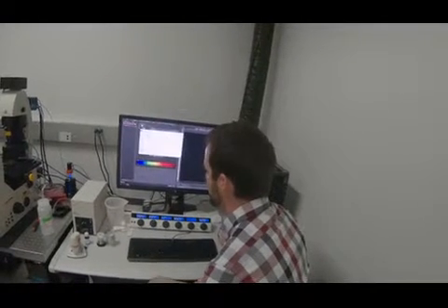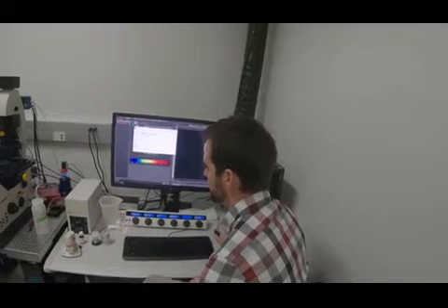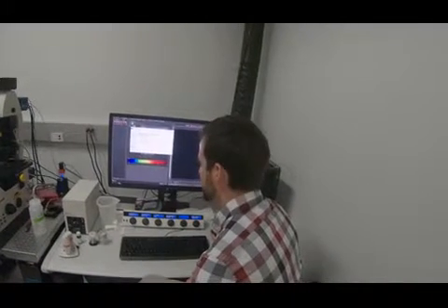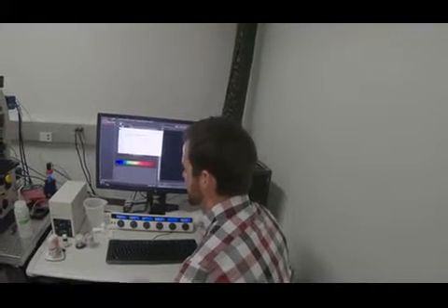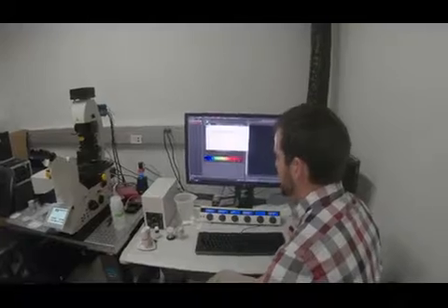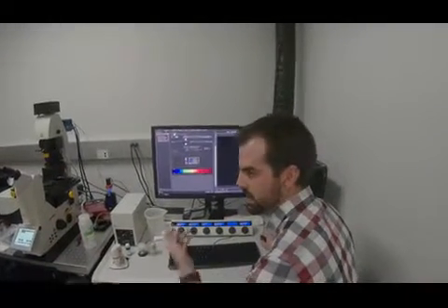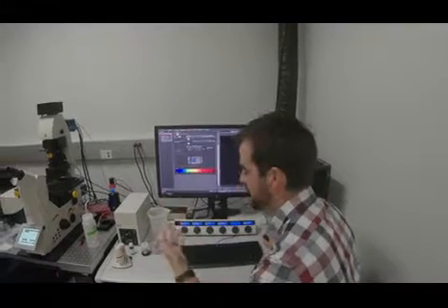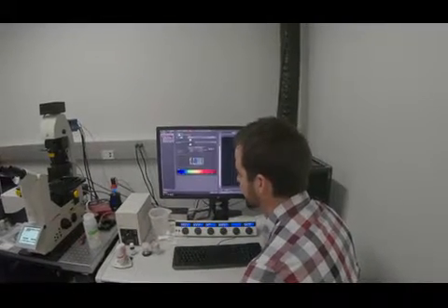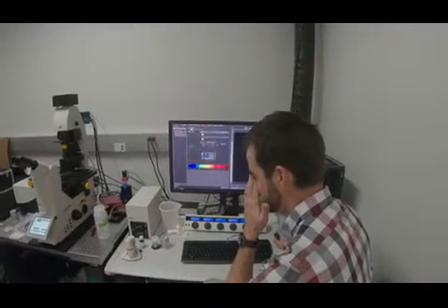So the data drive, this is what we create. This Tuesday best group LIF is like an image file. That's all you need. This is other stuff. And this is the 6 gig file. Within that are all these images, these stacks, time series, those tile scans. That's how I recommend it, and that's the raw data too.